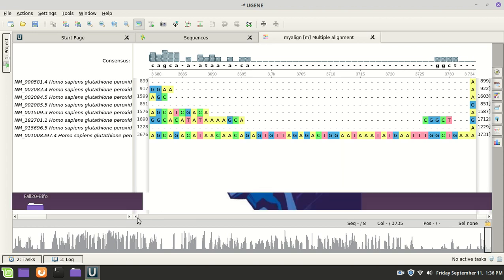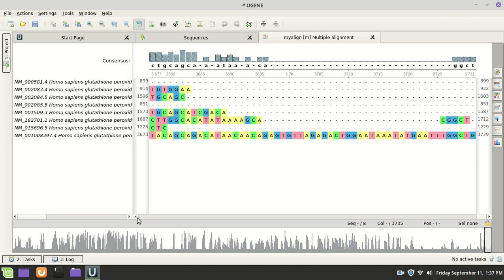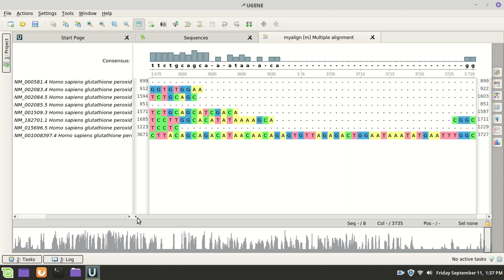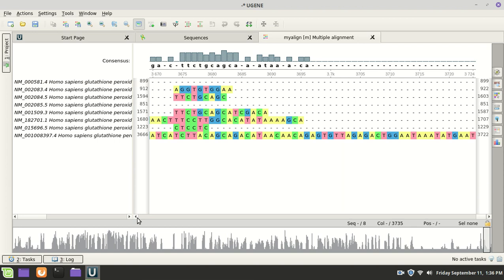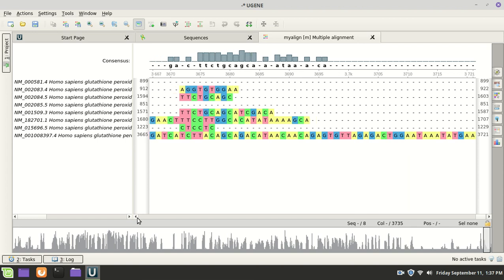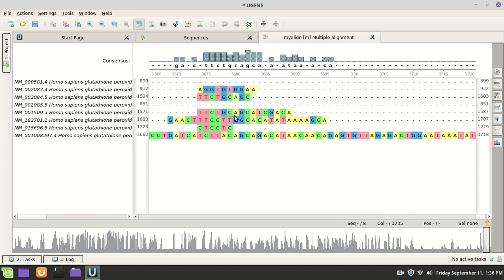All right, and just doing them 2 at a time with a dot plot, and then figuring out what pieces are similar, what areas, and then just picking out those areas and aligning them across multiple sequences. And you could find that area in several of them and put that in here. Just those small pieces that have aligned on the dot plot where you see the lines, you would take those out and put them in here, and that's probably the best way to do this.